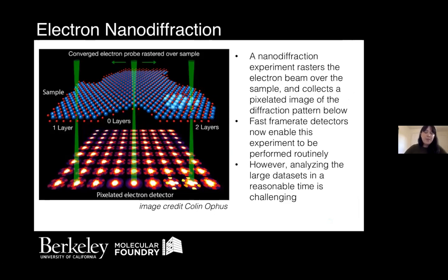So I motivated this talk by showing some very modern and useful electron microscopy imaging modalities. But so far, we've only talked about HRTEM and SEM data channels. So I want to talk a little bit about nanodiffraction and some of the limitations for incorporating it into high throughput workflows, which actually aren't only data interpretation, it's really data handling as well. Because as I mentioned earlier in the talk, these data sets can be extremely large.